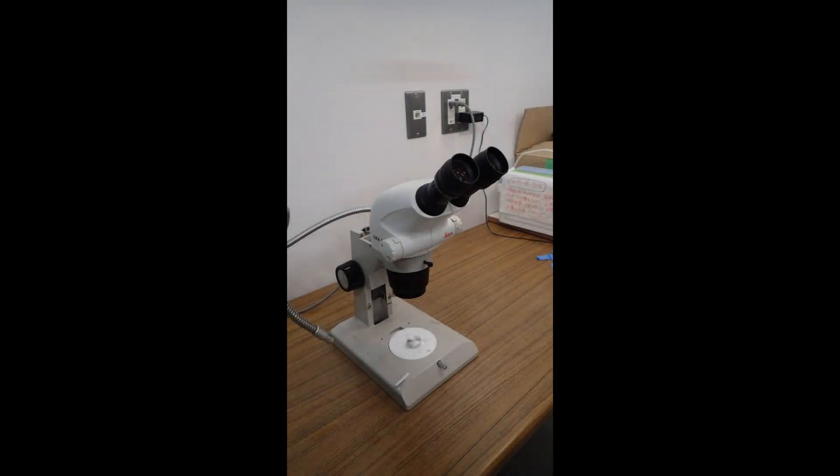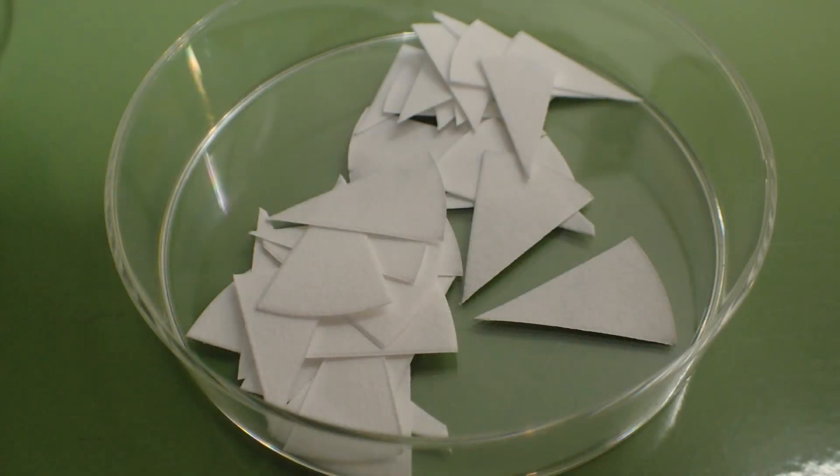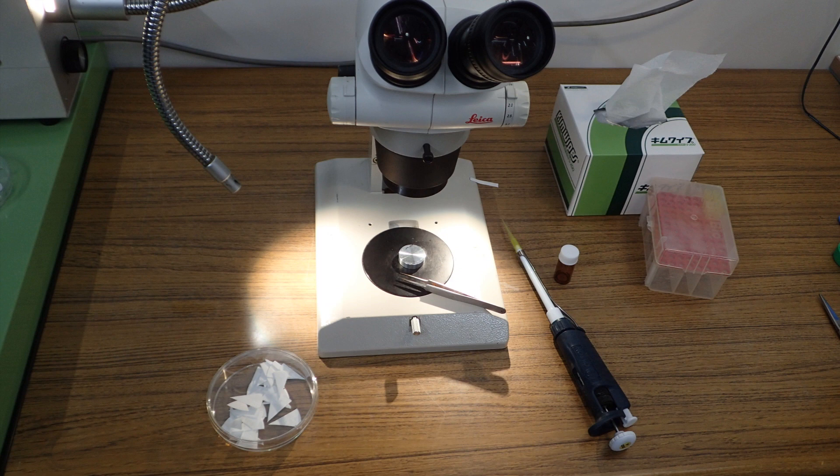Prepare a stereo microscope. Cut the filter paper into the appropriate size. This is a preparation for removing excess nanosuit solution. Prepare the sample stage, tweezers, pipetmen, tips, kim wipes, etc. on the laboratory table.